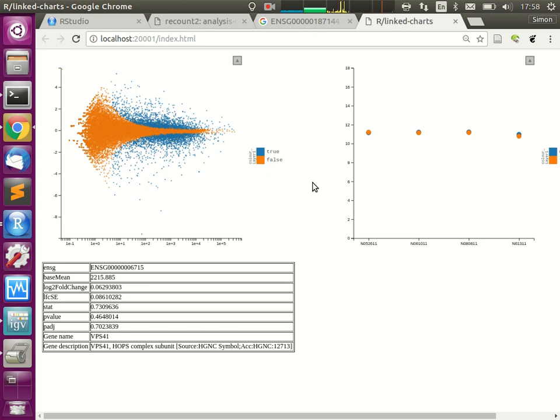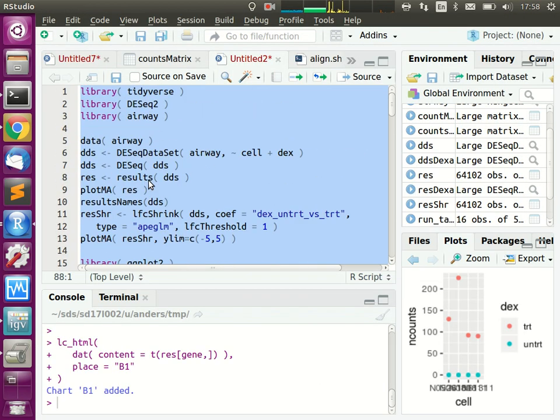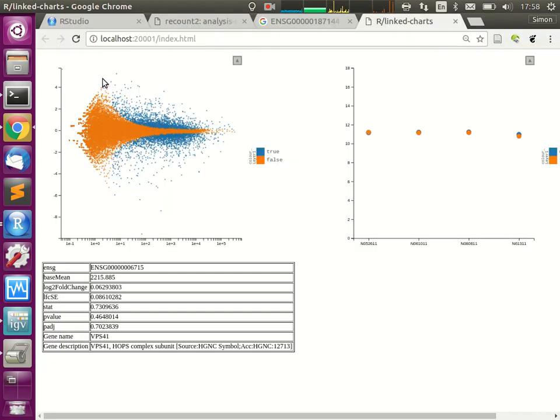Hence, there are 2 things which we now have. One is maybe we shouldn't care about this at all. Once the magnitude is large enough, we probably do get these things right. And for this, DESeq now has this new thing which we call the log fold change shrinkage. Because here, these things were probably not true.